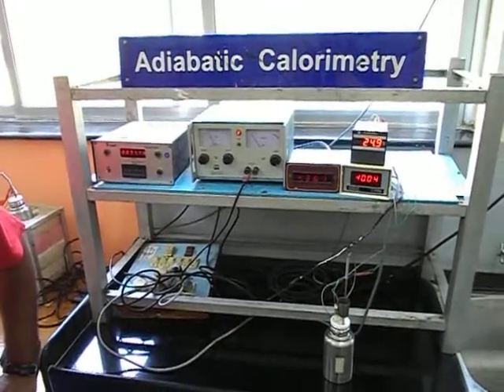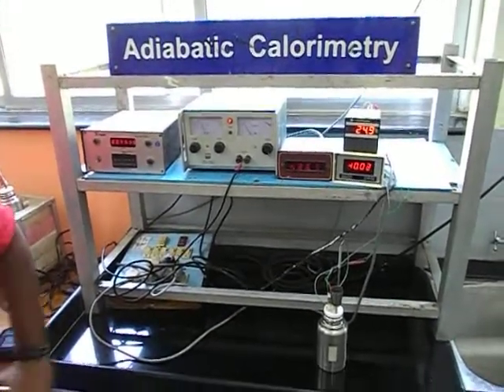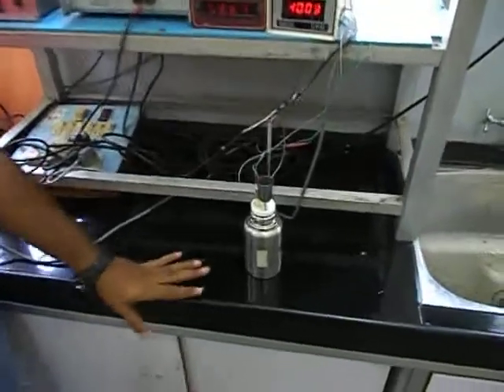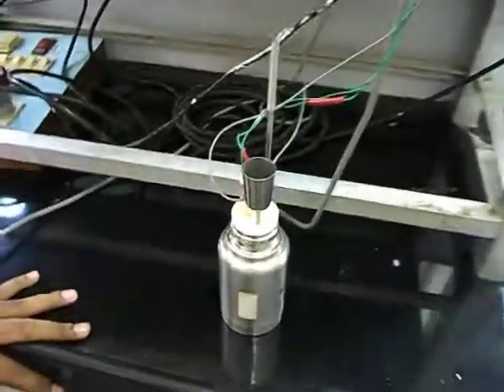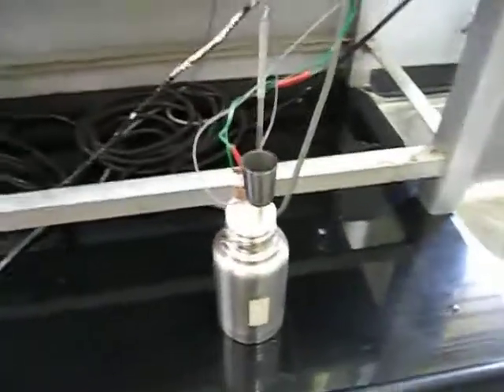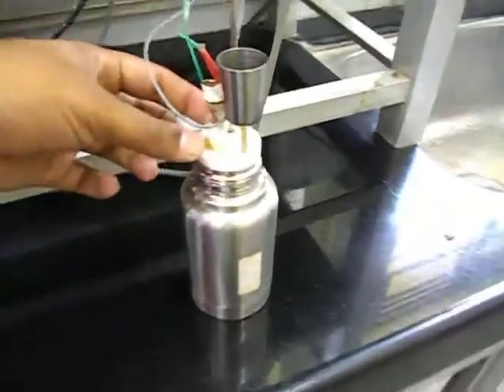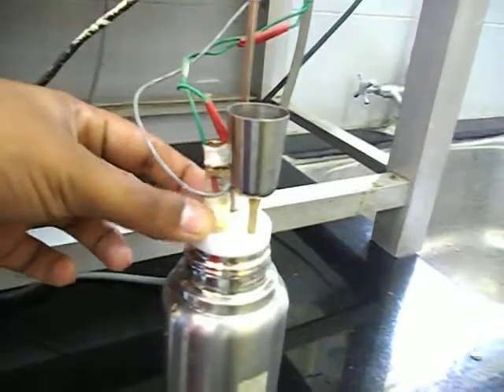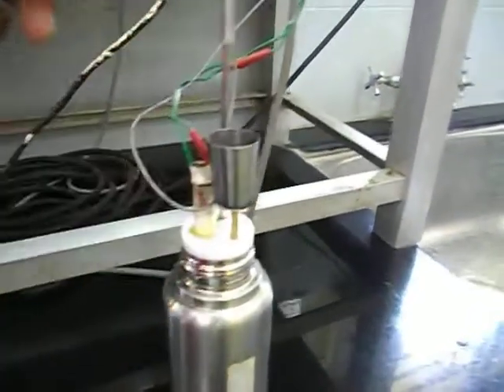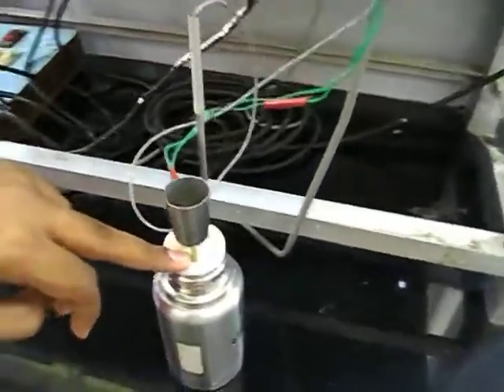The setup for adiabatic calorimetry experiment. Here we see the flask in which the two fluids will be taken. There is a heating coil inside the flask, the tip of which we can see here. This is the temperature probe and this is the funnel to input the liquids.